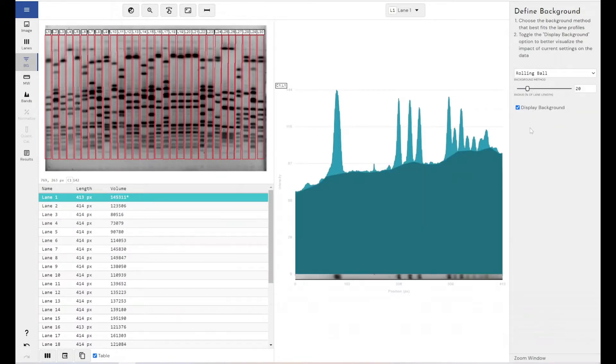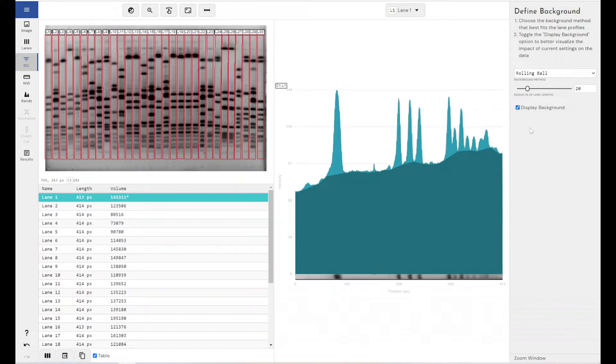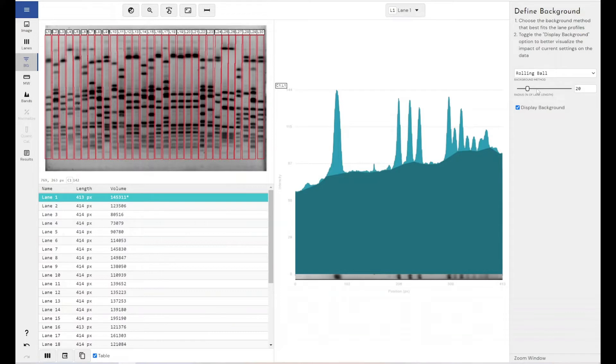Now, rolling ball is actually an algorithm that dynamically adjusts the background removal technique along the length of the lane. And it does this by theoretically rolling a ball underneath the profile of a lane of a fixed size, and settings change the fixed size as a percentage of lane length of that ball.